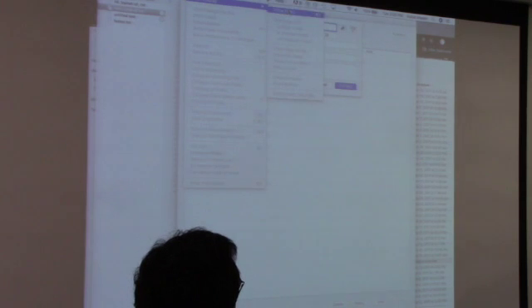All right, let's see if we can make this text any bigger. Go to View, Text Display, Show Format.